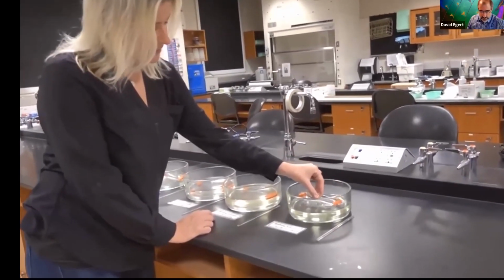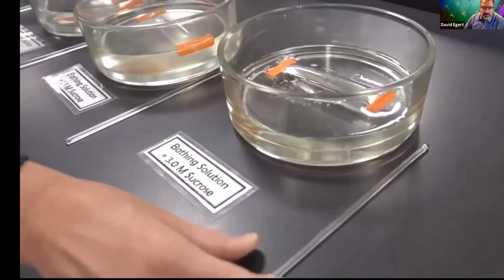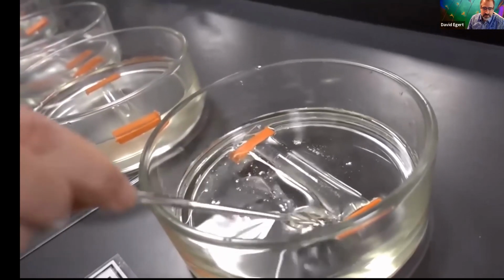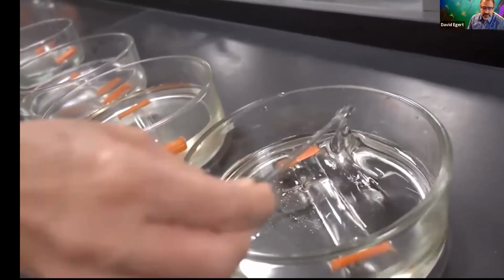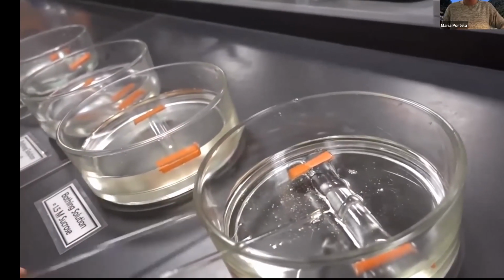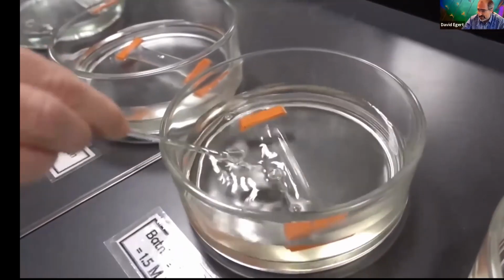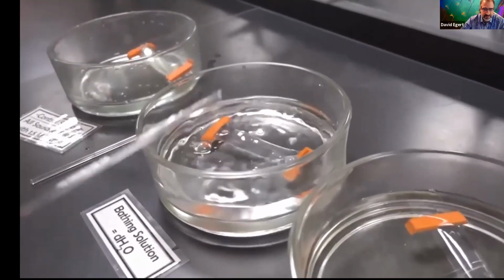And then this last one has 3.0 molar sucrose solution. If I stir it, you can see it's quite concentrated and sticky and thick, versus here it still has sugar in it, but it's a lot more dilute. And then distilled water, of course, is just distilled water.